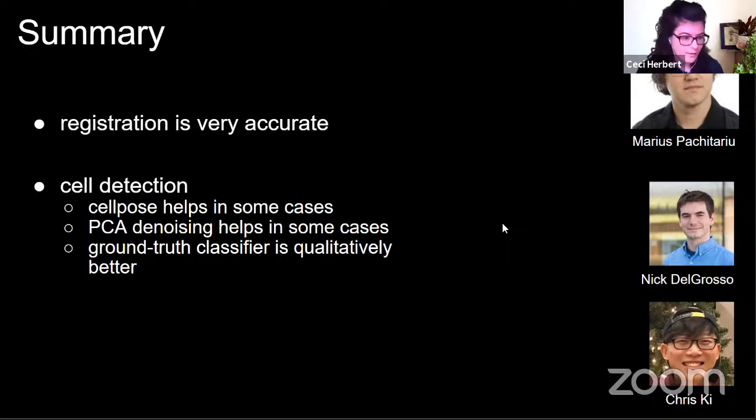And we have one question just now, if you can take it, Carsen. Can Suite2P output non-ROI pixel values in relation to my SNR question? That's to say, not soma, but neuropil.